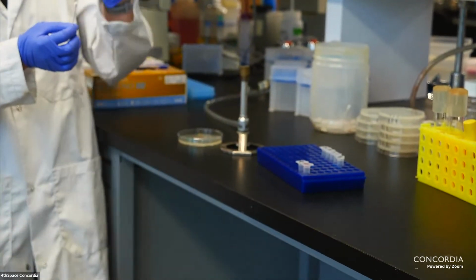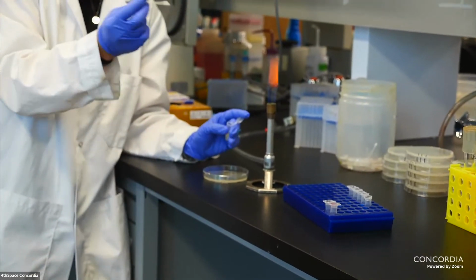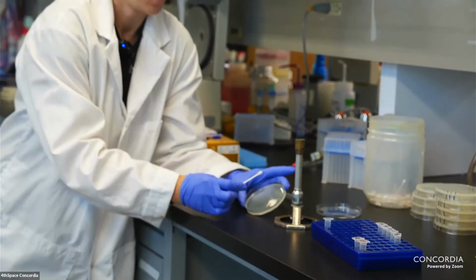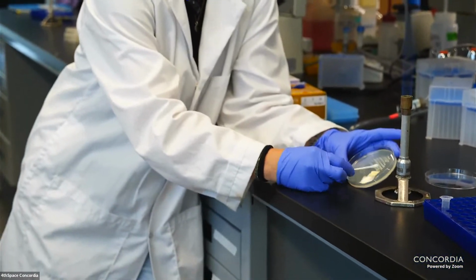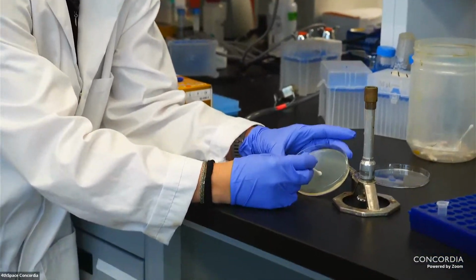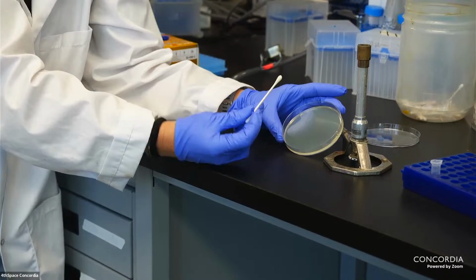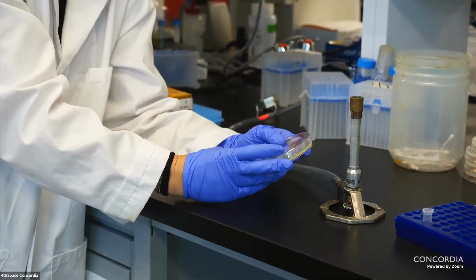So if you take a culture, you're just going to pop it open close to the flame. You can dip your cotton swab or toothpick in the culture. And then you take the lid off and you just touch it to the surface here. So you just kind of go across like this. And of course, in whatever pattern you want, you can do like a little smiley face like this. Just be careful not to press too hard that you're gonna break the plate. So that's pretty much it for that. And then you put the lid back on when you're done.